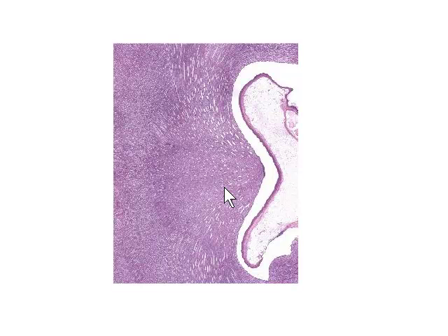Here's a slightly different kidney section than the one we previously looked at. In this one, what we're looking at is the arrangement, disposition, and structure of the mucosa that lines the renal calyces and the renal pelvis. To orient you: what we have here is the tip of a medullary pyramid, or papilla, which is surrounded by a cup-shaped minor calyx. Urine drips from the tip of the medullary pyramid and is caught in this cup-shaped structure, which converges to form the minor and then major calyx, and these converge to form the renal pelvis.